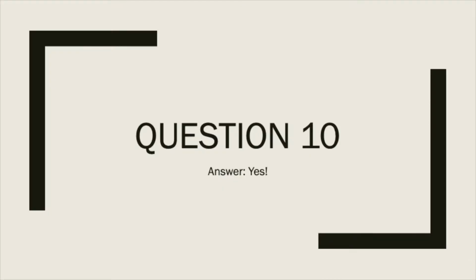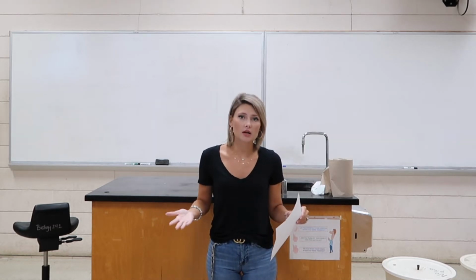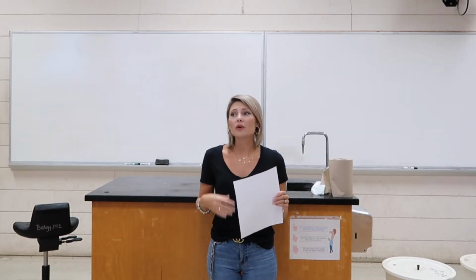Number 10, do you understand that safety goggles, lab aprons, and latex gloves are available for you? Yes. Like I said, we do have goggles, we do have lab aprons. Again, there's never going to be a time where I'm going to tell you to go put those things on, because as long as you follow directions, you're not going to come in contact with anything. But we will wear gloves. Usually we like to wear them whenever we're dealing with the stains, because we don't want you to stain your hands. As long as you use aseptic technique, the bacteria hopefully is never going to come close to your hand, so you don't have to worry about that. And when it is time to put gloves on, I will let you know, or your instructor will let you know when that time comes.